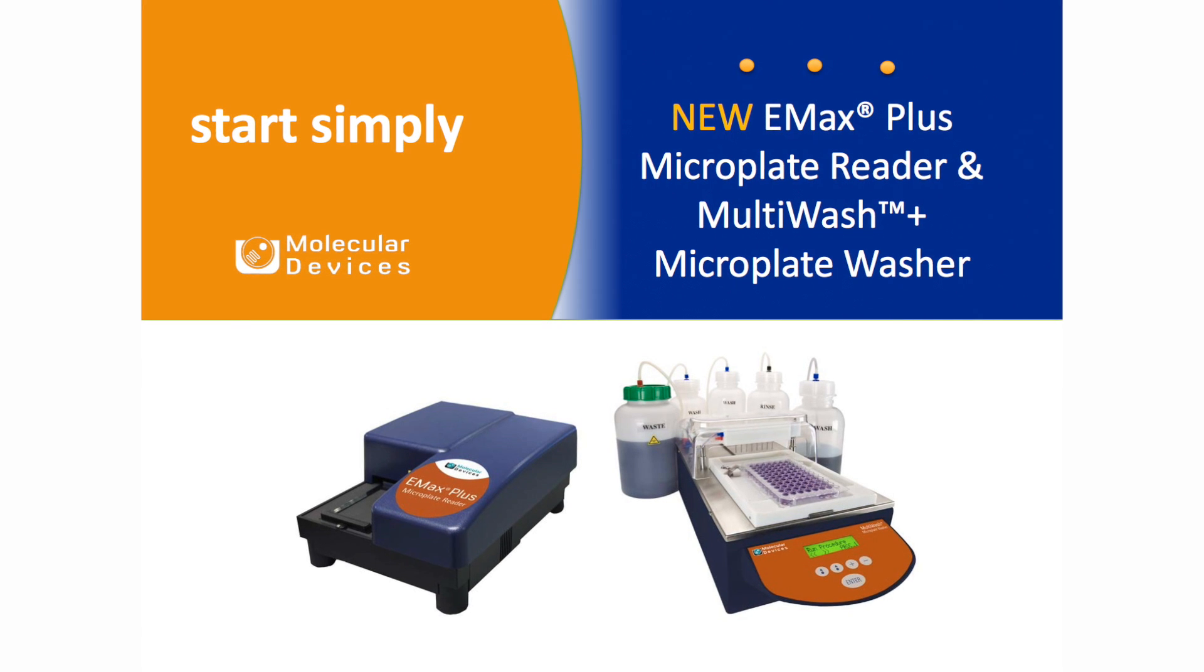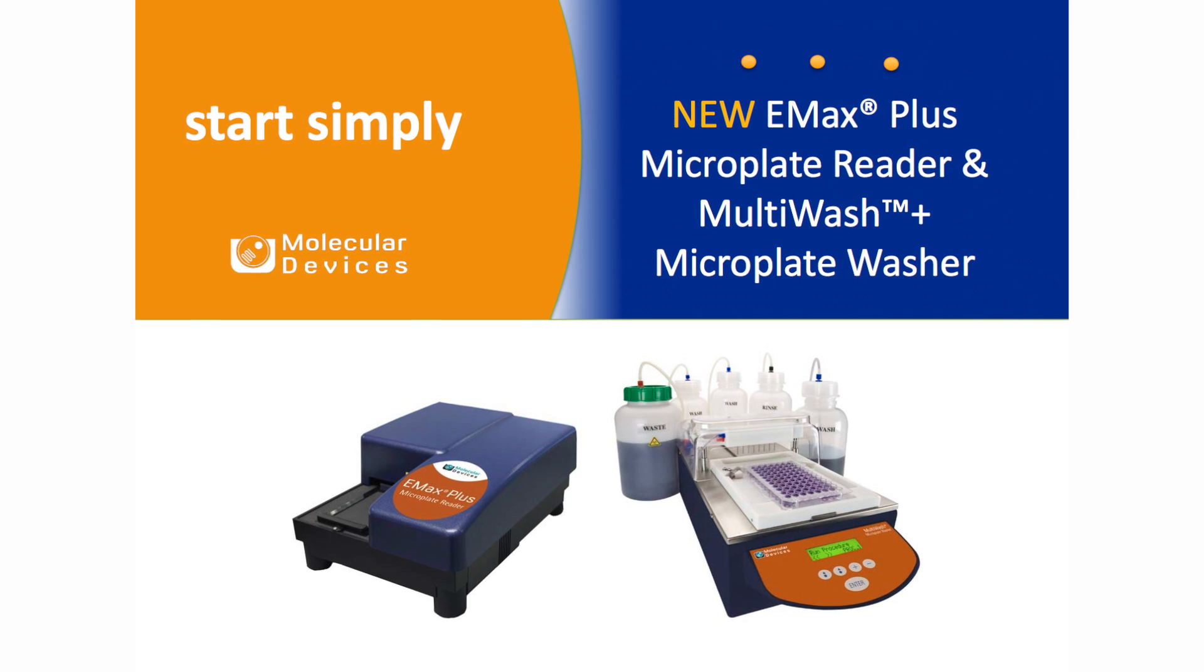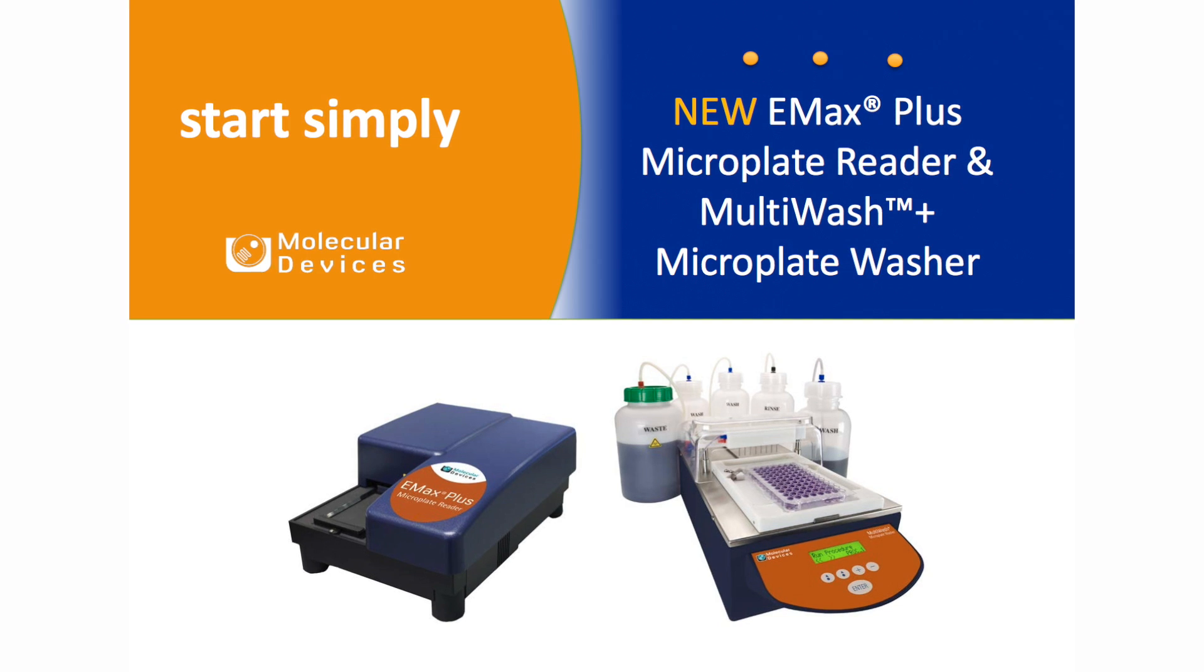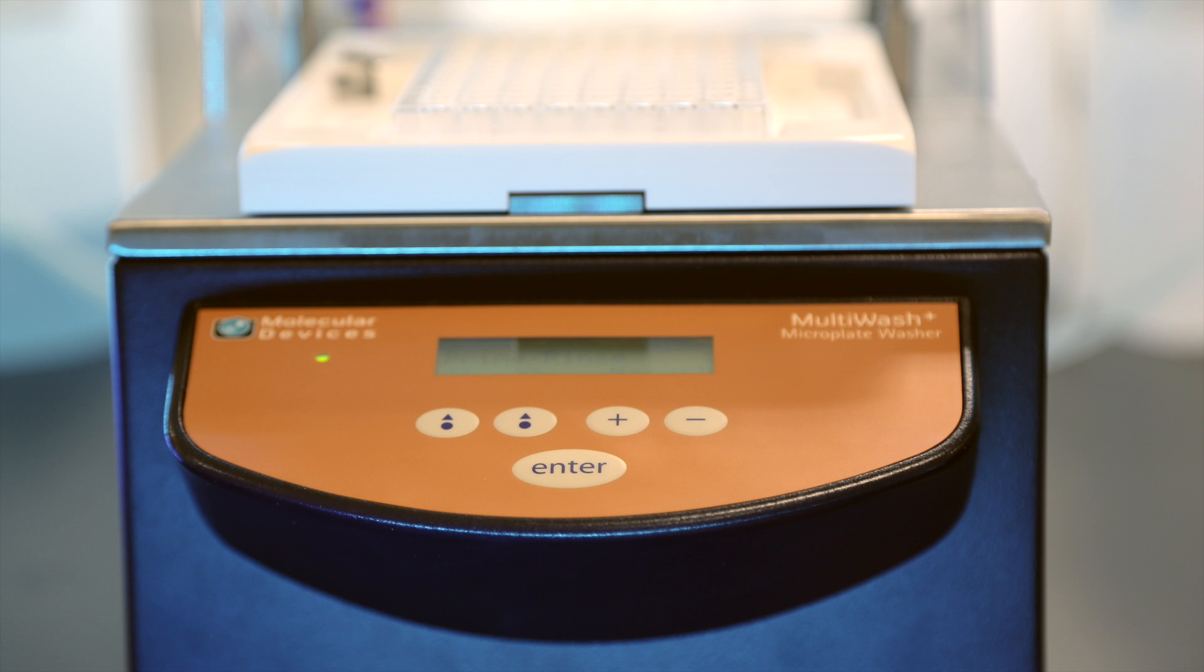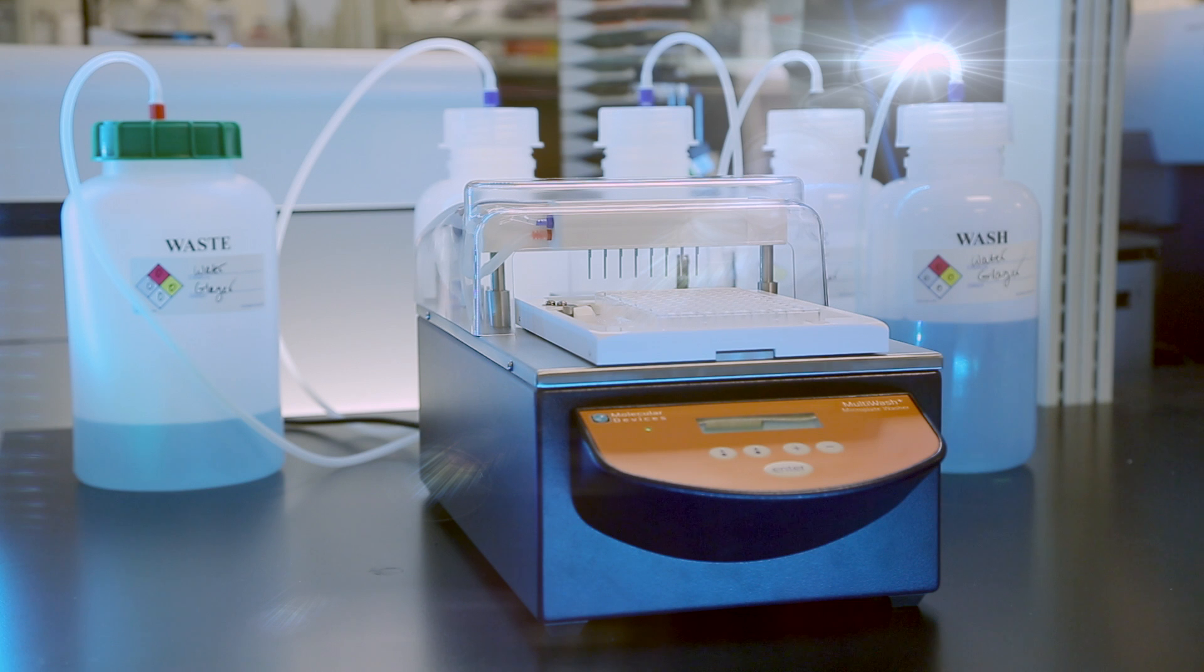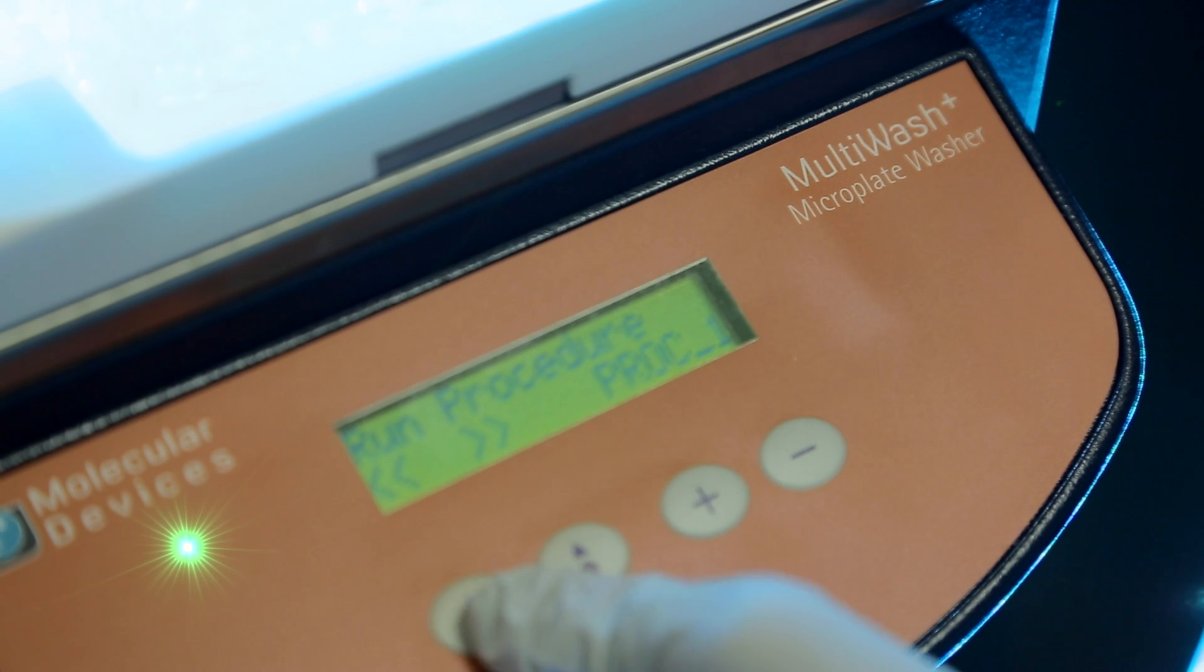Introducing the Emax Plus Microplate Reader and the Multi-Wash Plus Microplate Washer. The Multi-Wash Plus can be incorporated into your ELISA workflow as a washer and dispenser combination in one compact instrument.